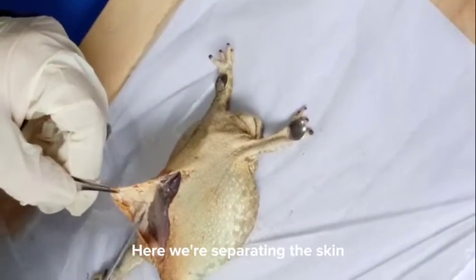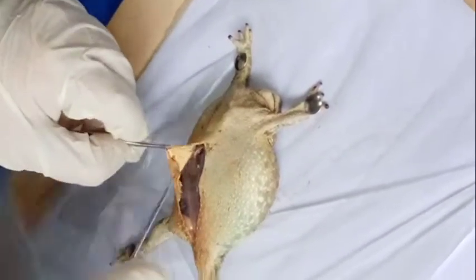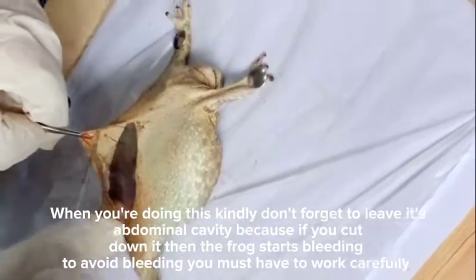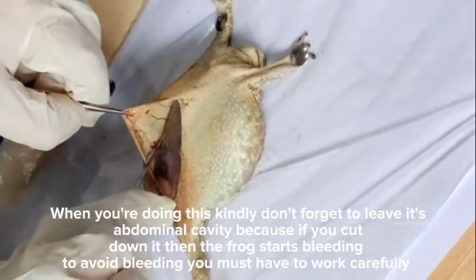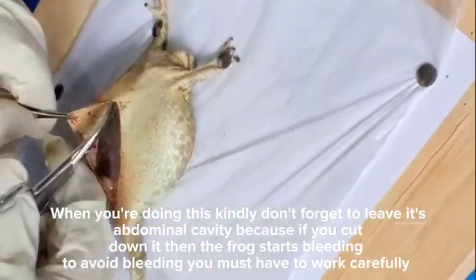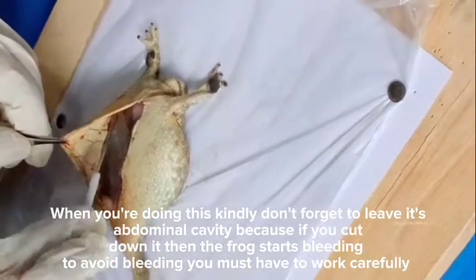Here we are separating the skin. When you're doing this, kindly don't forget to leave its abdominal cavity because if you cut down it, then the frog starts bleeding. To avoid bleeding, you must have to work carefully.